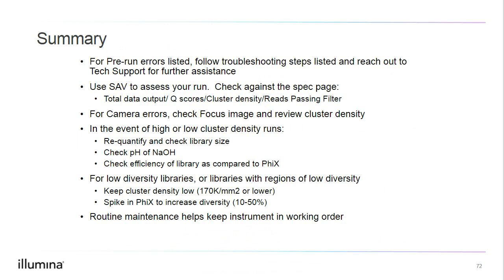Here's a brief summary of the information provided in this webinar, specifically for the pre-run errors and troubleshooting, reviewing run metrics and SAV, run errors and troubleshooting, low diversity libraries, and instrument maintenance.